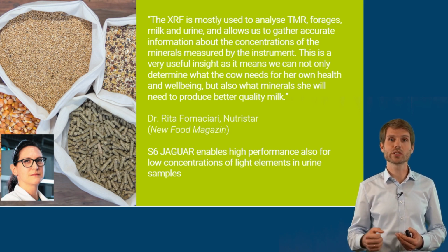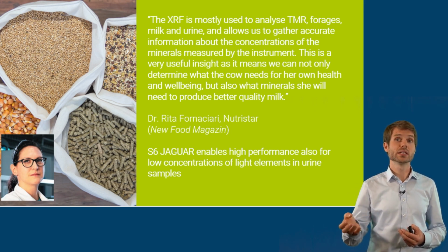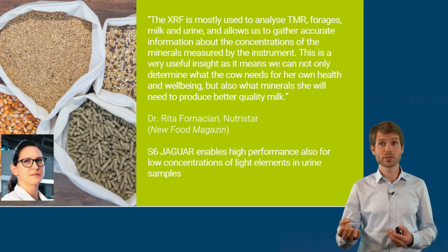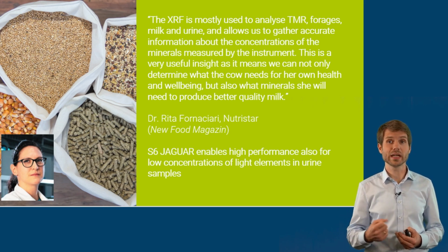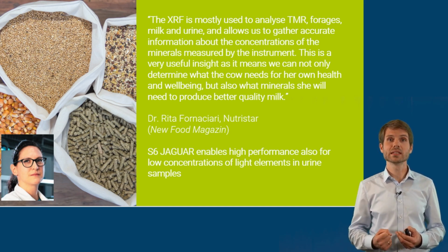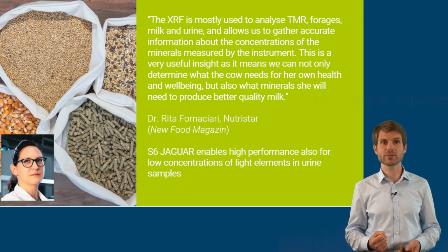Here they are looking into feed, TMR, forages, milk also, and urine samples. They also want to get the feedback from cow urine to understand essentially how the different diets impact the cow's well-being and the nutritional uptake.